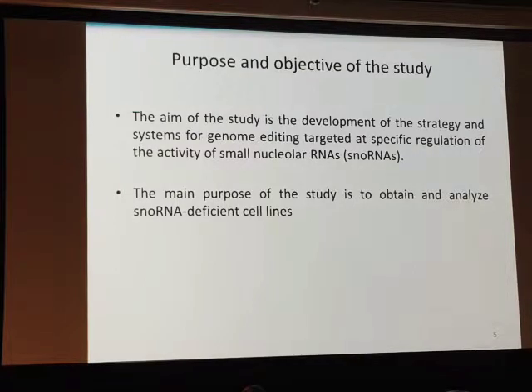The aim of the study was to develop the strategy and the systems for genome editing targeted at specific regulation of the activity of snoRNAs. And the main purpose of the study was to obtain and analyze snoRNA deficient cell lines.